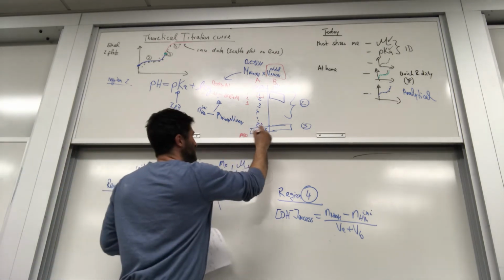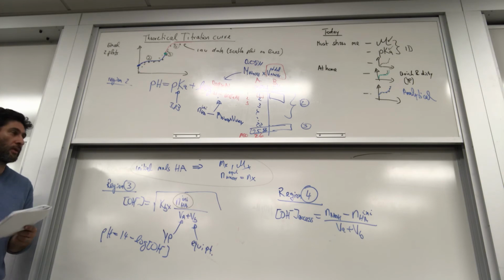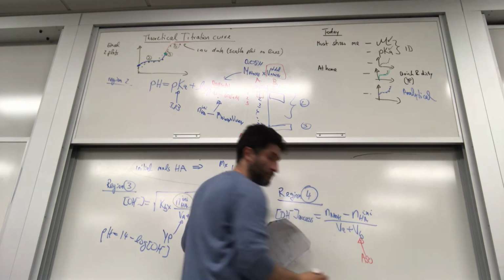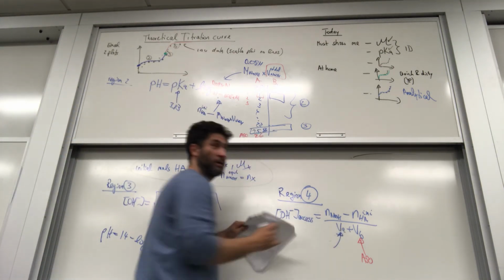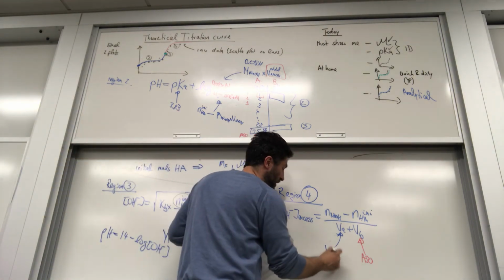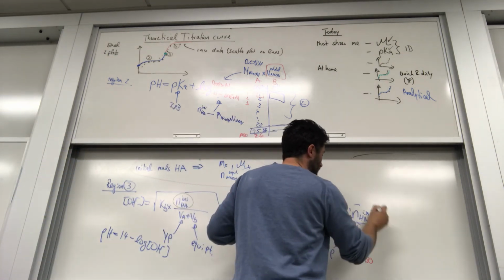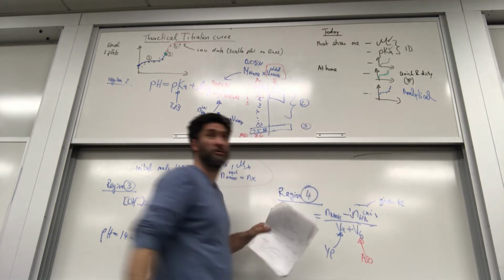And A50 is 26 milliliters. Volume of base added is A50. Volume of acid added, that's the number you weighed out in your yellow pages initially, like 50 milliliters or whatever that is. This number here is a given number. We calculated this earlier.